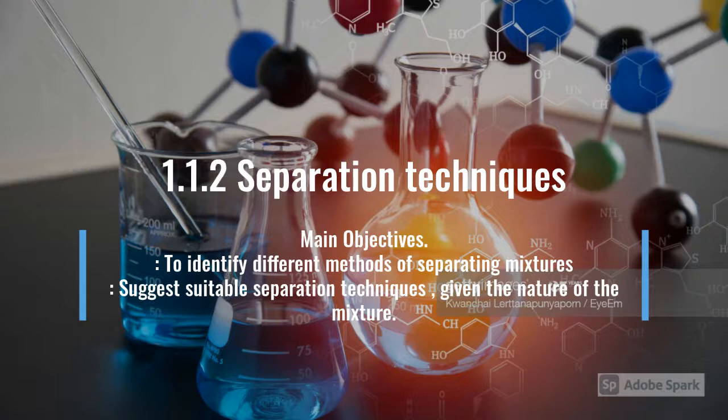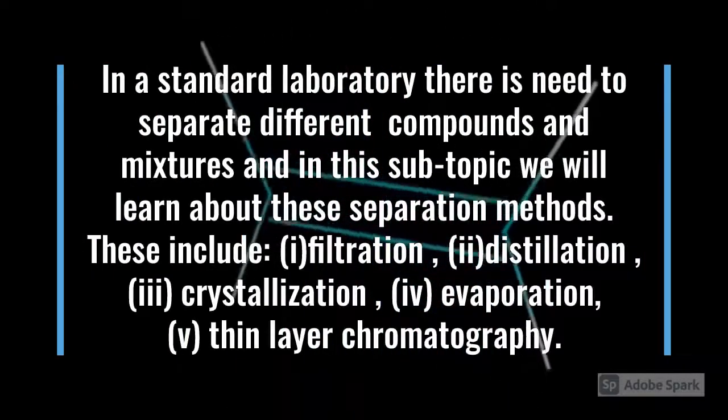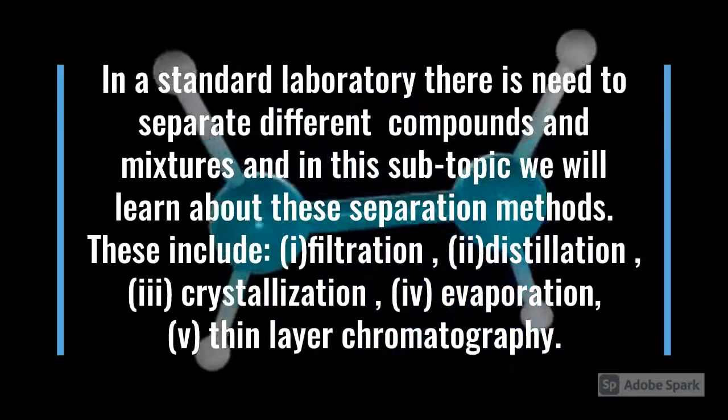The separation methods which will be under discussion include filtration, distillation, crystallization, evaporation, as well as thin layer chromatography.